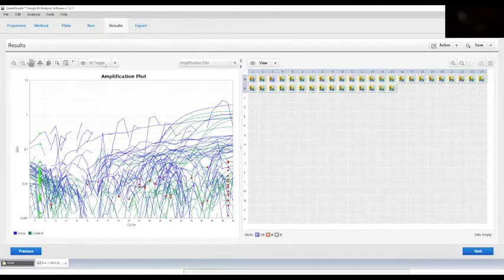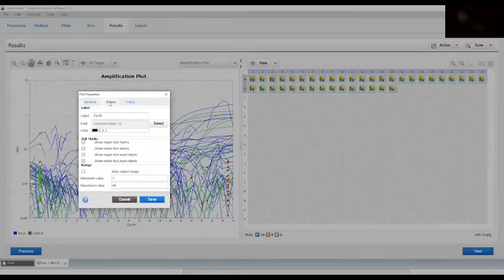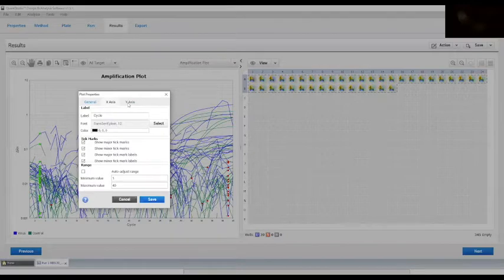Click on plot properties. Choose automatic range value, then it automatically calculates by showing you the amplification plot.